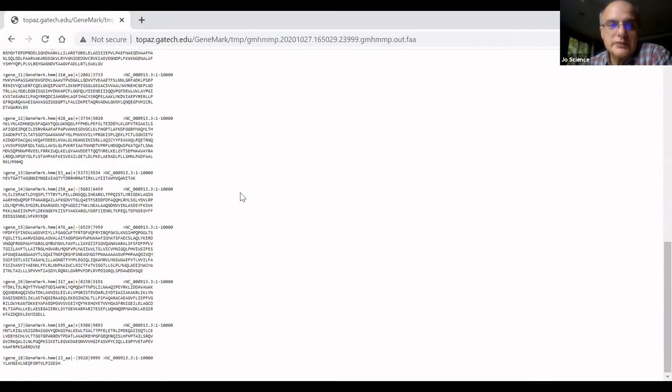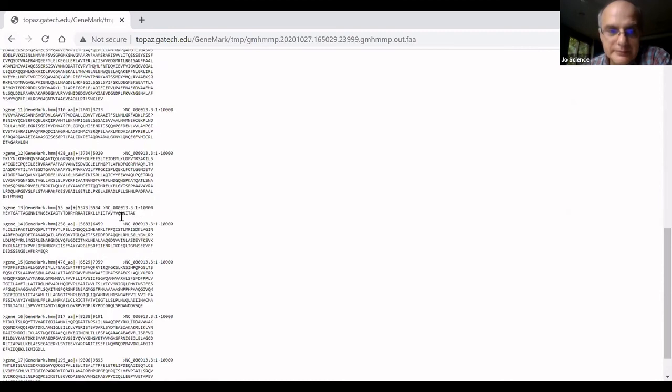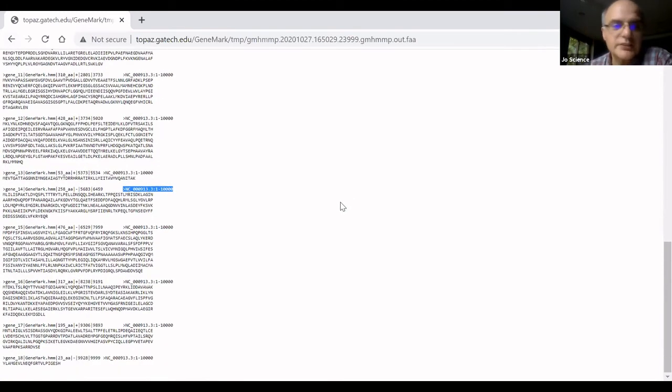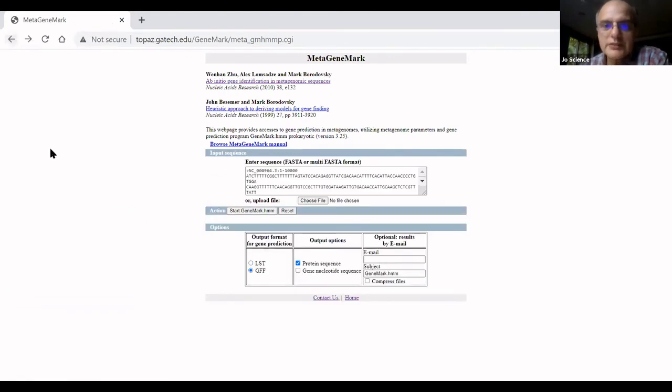The only thing is you can track the idea of a sequence and say, okay, this is this context, this is that context, but all the predictions we can just submit from here to BLAST, and they come back with a high quality annotation. Okay, what changes if I have a 100 megabase or 1 gigabase genome?